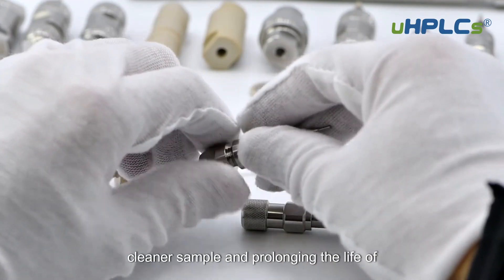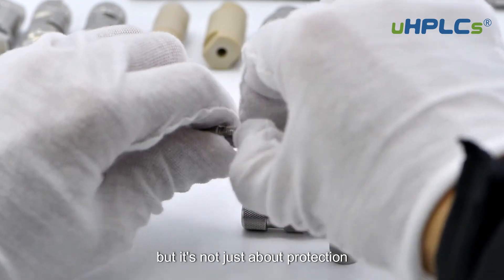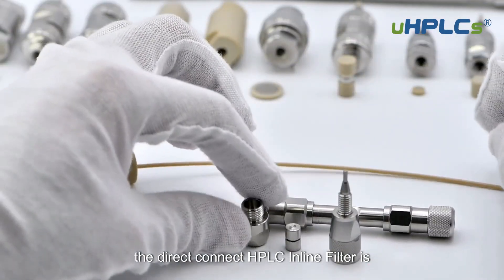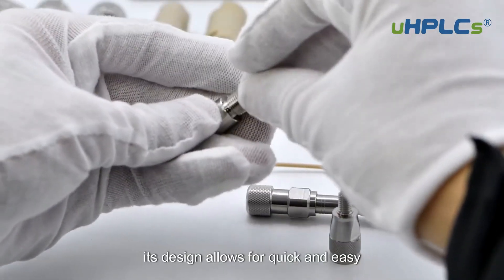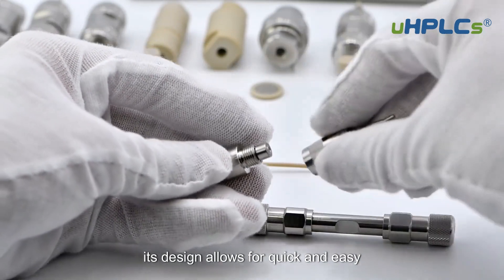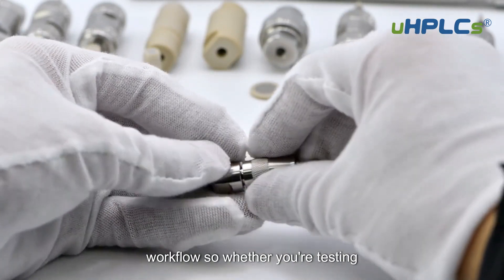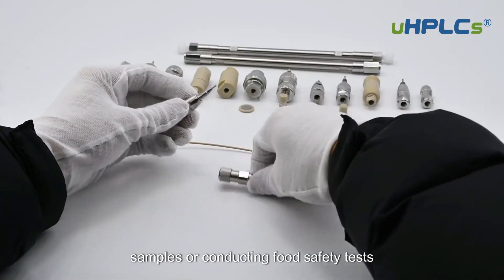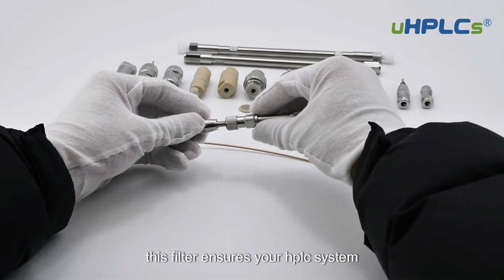The Direct Connect HPLC Inline Filter provides a cleaner sample and prolongs the life of your analytical column. But it's not just about protection — it's also a champion of convenience. Its design allows for quick and easy replacement without interrupting your workflow. Whether you're testing pharmaceuticals, analyzing environmental samples, or conducting food safety tests, this filter ensures your HPLC system operates at its best.